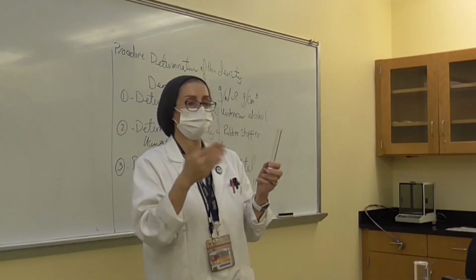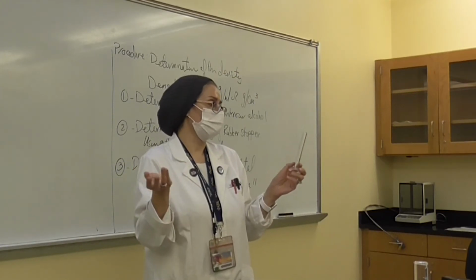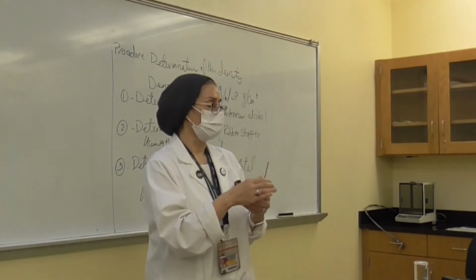If the measurement is like 5.2, that's fine. If it is 5.5, that's fine, up to 6, right? Even if it is 6.1, that's fine, you should be okay, as long as you write it down. So this is the volume, right?